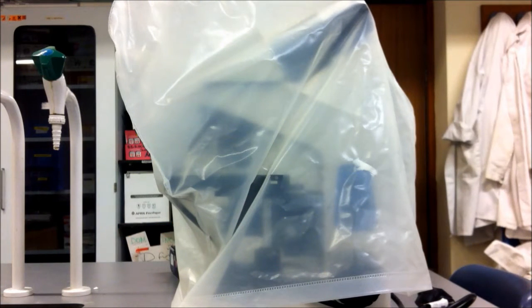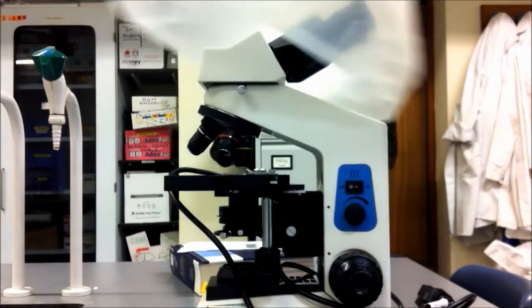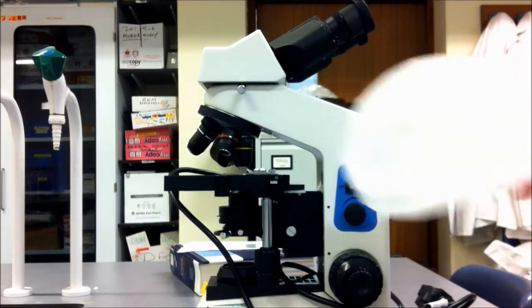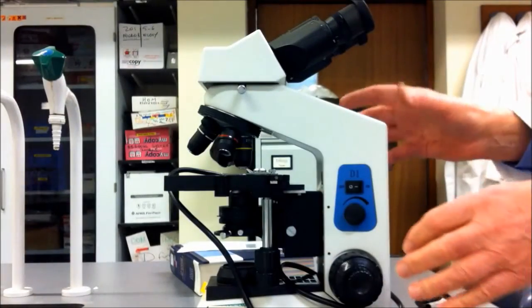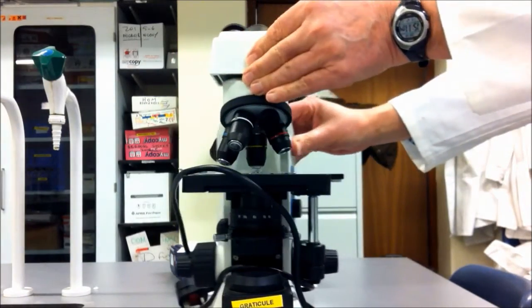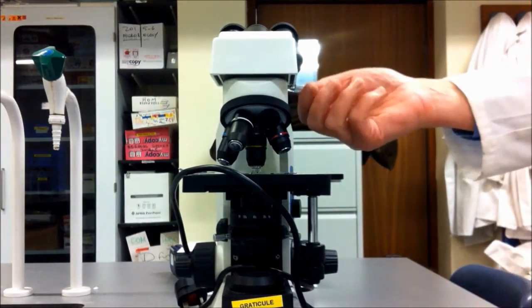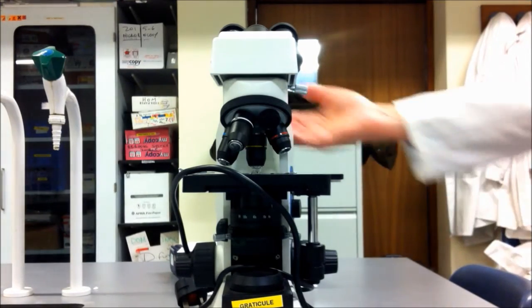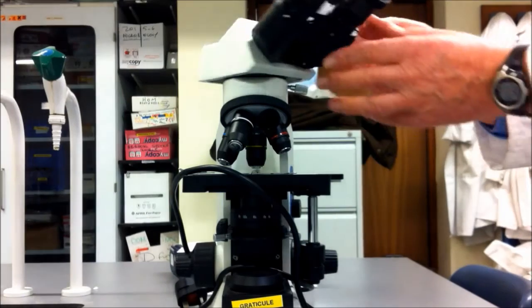I'm going to run through the procedure for setting up and using a microscope. The first thing we need to do is to rotate the eyepieces. To do that, we're going to slacken off a little silver knob on the side, turn the eyepiece around, and just tighten it finger tight.